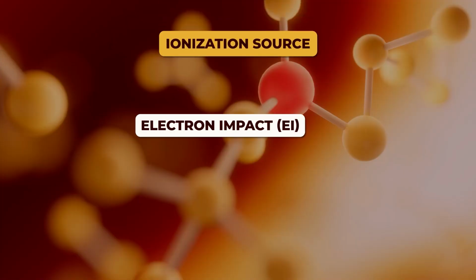In the same way, the ions would be generated here, and those ions would be isolated and analyzed based on mass to charge ratio. What are the techniques for creating the ions? Either by electron impact, where we bombard with energetic electrons, giving a fragmentation pattern, or we can ionize by chemical ionization, that is, reagent gaseous ions or proton adducts. Equipment based on both techniques is available. Depending on our requirement, what kind of samples we are analyzing, we do it either by EI or by CI.